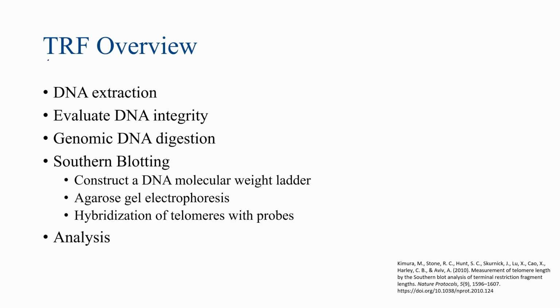And welcome to this module on telomere restriction fragment, or TRF for short. So telomere restriction fragment is a method of quantifying telomeric lengths in DNA samples of eukaryotic cells.